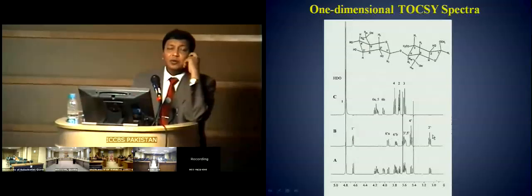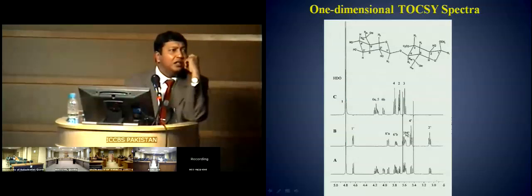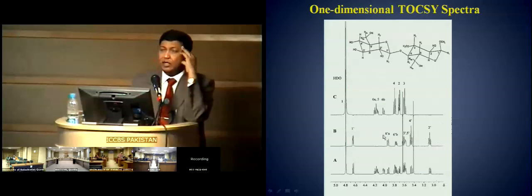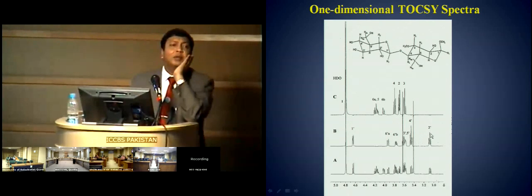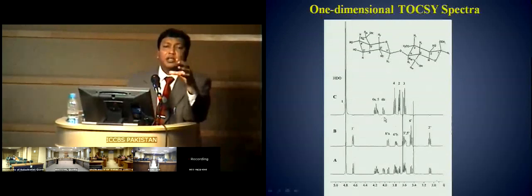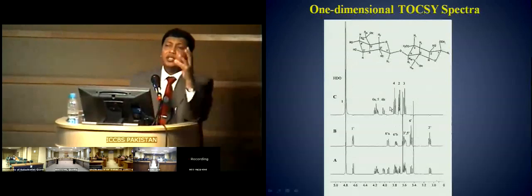So this is not the proton NMR spectrum, but the spectrum of a coupled network. You would see only the COSY coupled, geminal vicinal coupled, and in 40 you would see some more coming up, and then in 100 you would see all of them coming up as a whole spectrum. So the whole NMR spectrum of a spin system appears when you have a longer mixing time. Okay?